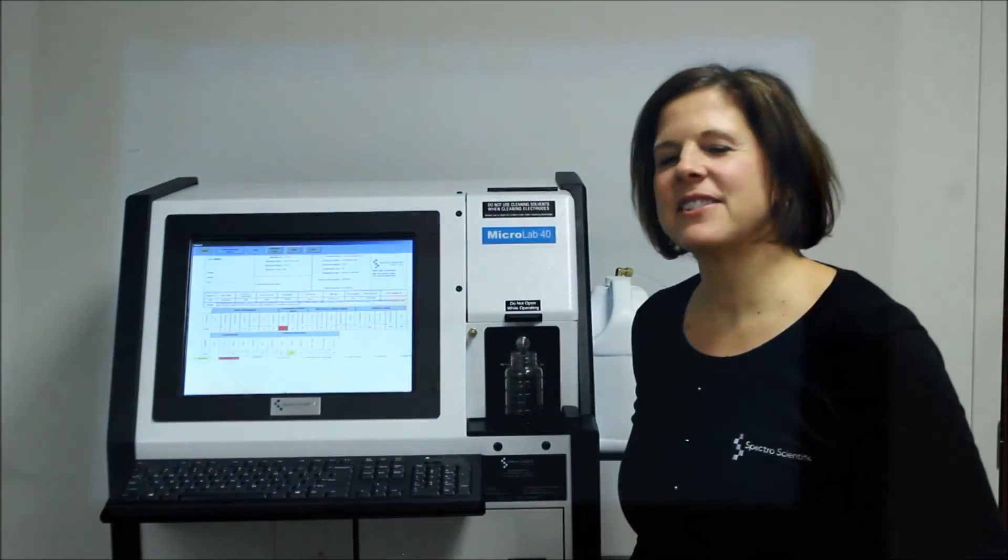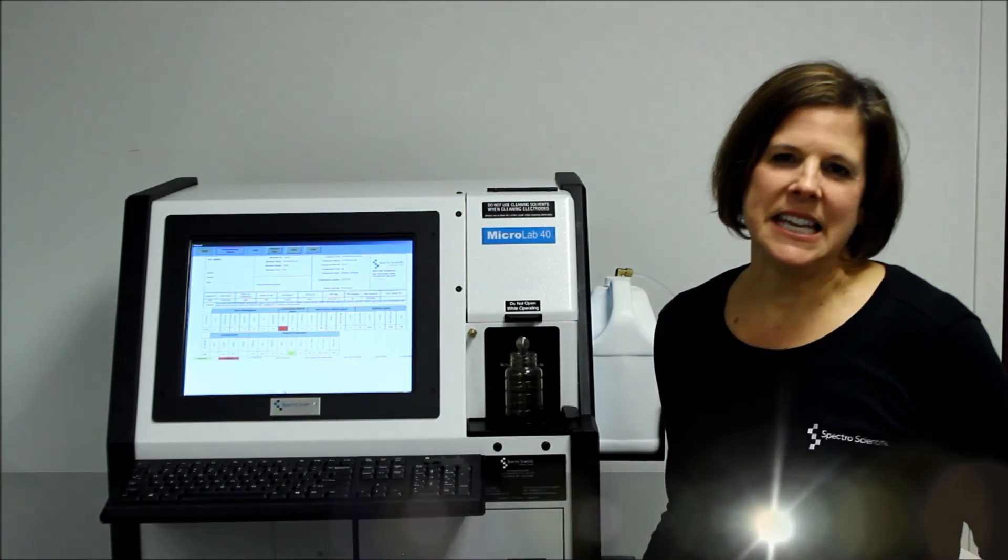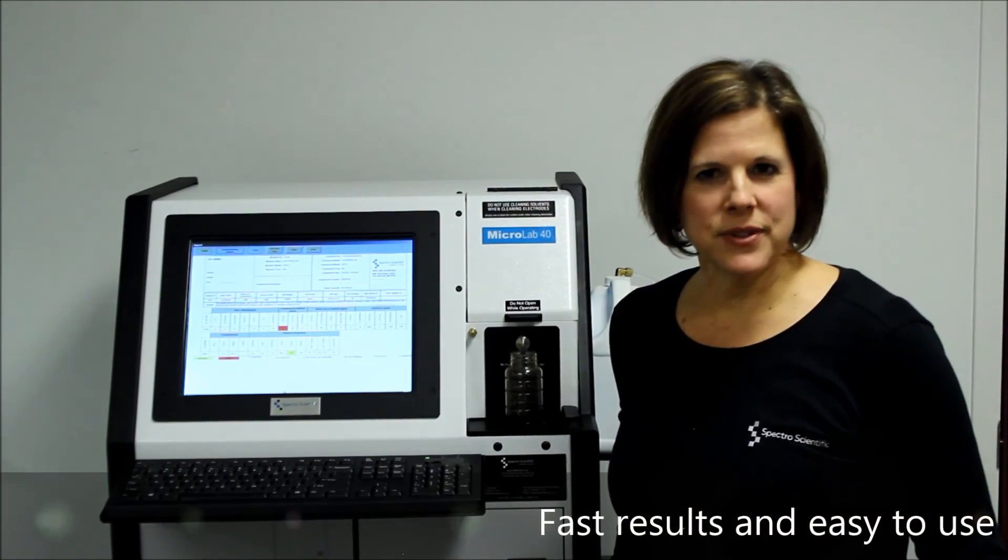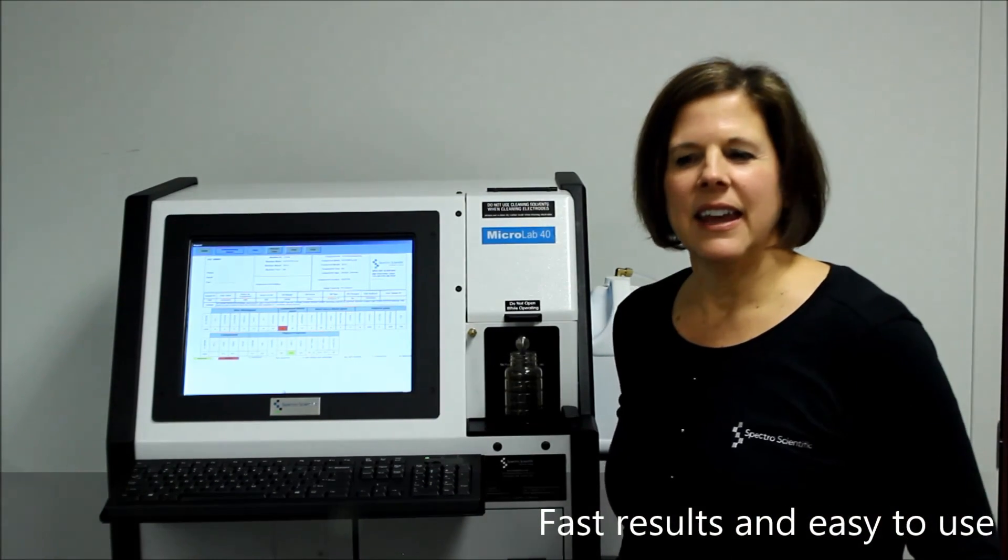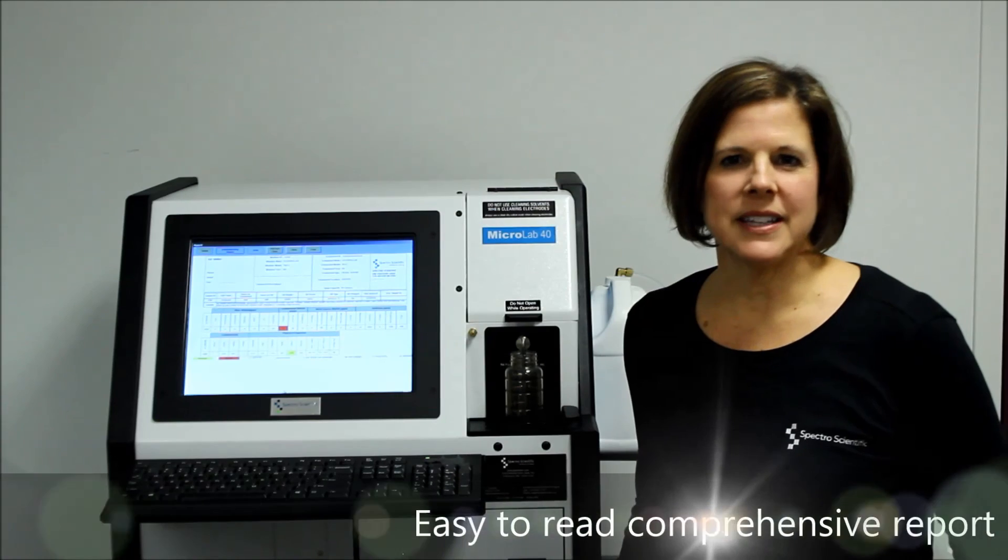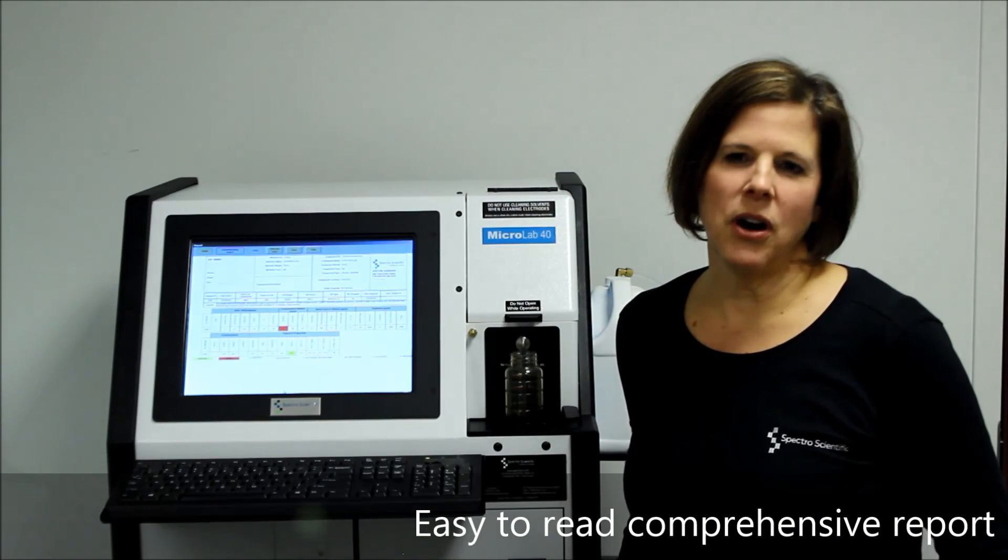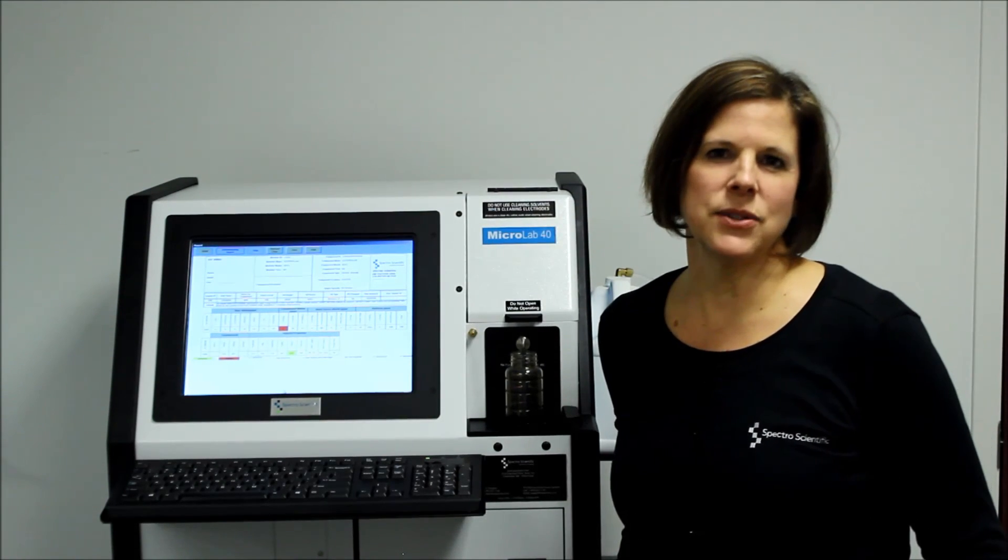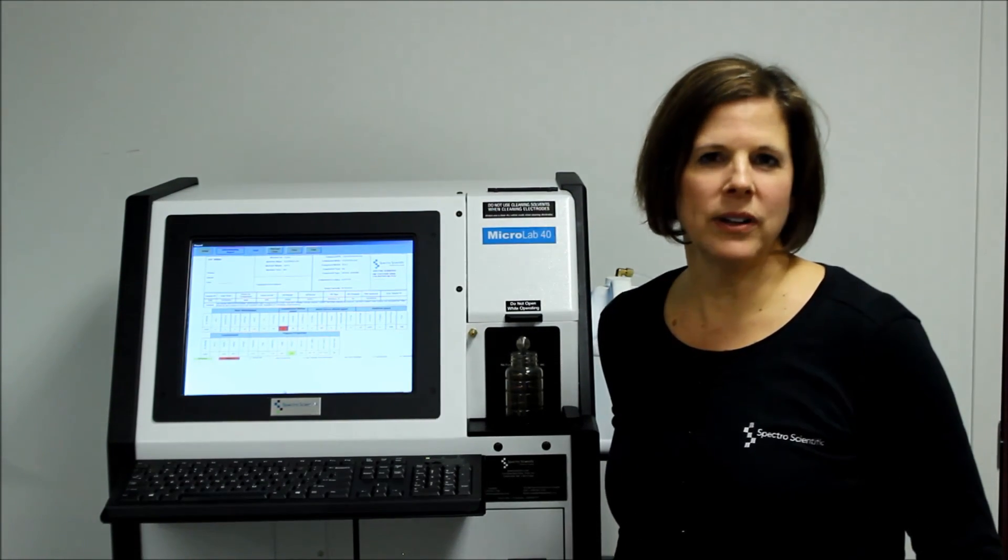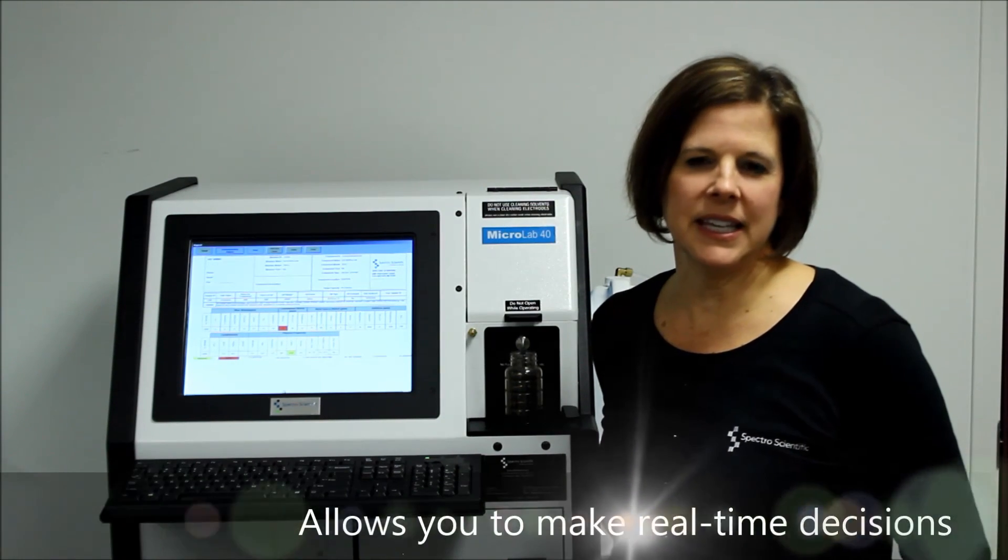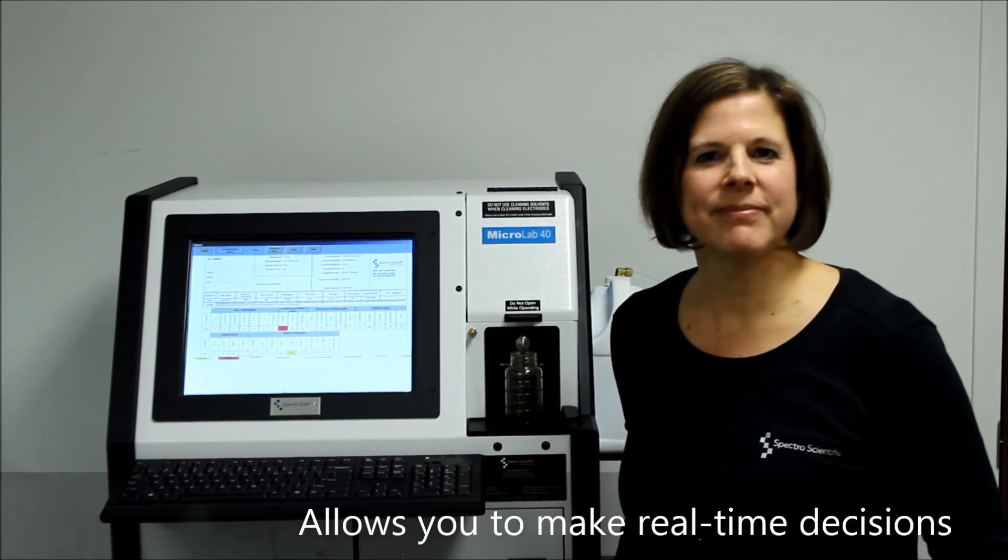So that's all there is to running the Microlab. It's easy to use, gives fast results, and a comprehensive report that's easy to understand. It gives you all the tools that you need to do oil analysis on site and make real-time decisions. Thank you.